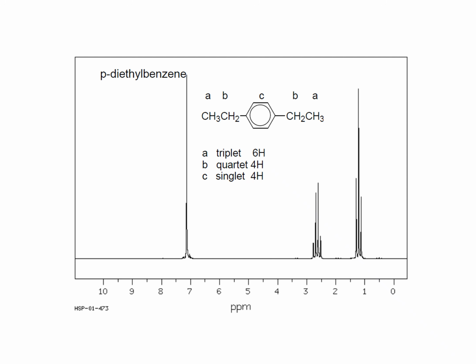Then para-diethylbenzene. So how much environment here? So, this benzene is one environment. Obviously it will have 4 hydrogen. Okay, so benzene is having 4 hydrogen, so that would always be singlet, nothing to say. And its position would be 7. So benzene's characteristic is like that, nothing else.